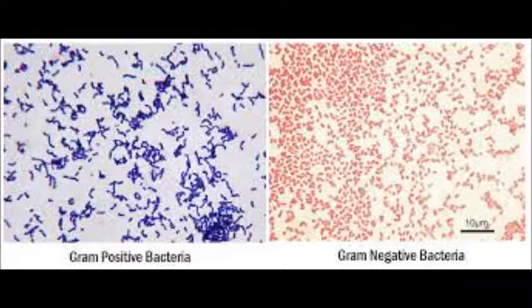Once you get done with blotting your slide dry, you would put it underneath the microscope, starting at the lowest magnification, focusing in all the way until you get to the second highest magnification, which should be 40 times. Once you're there, you would turn your microscope lens halfway, add a drop of oil to where you're looking, and turn it to the 100 times oil lens. From there, you should be able to see what is in the pictures here.